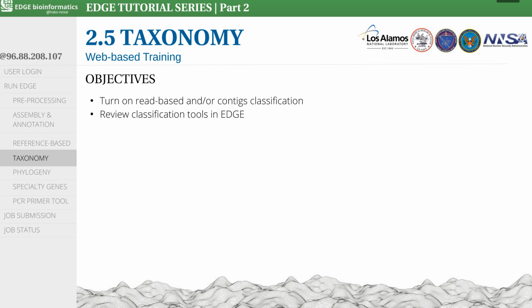This video is going to explain the taxonomy classification module in EDGE. After this tutorial, users will know when to turn taxonomy analysis on and how to grasp the different classification tools available within EDGE. As a reminder, we are running two job submissions in parallel.